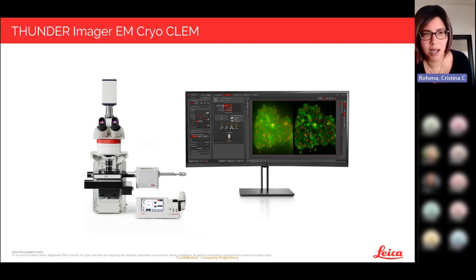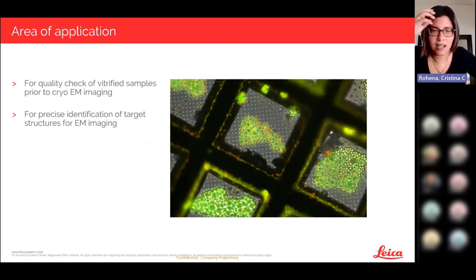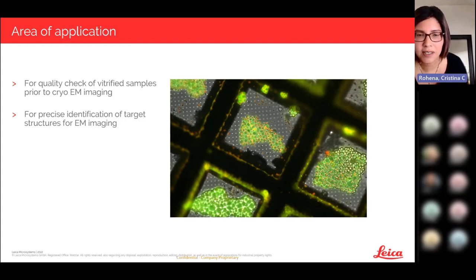So what really is the area of application that we're looking at here? Traditionally, when you're looking at EM CryoCLEM, this is a pretty significant long workflow that involves multiple systems, multiple steps.